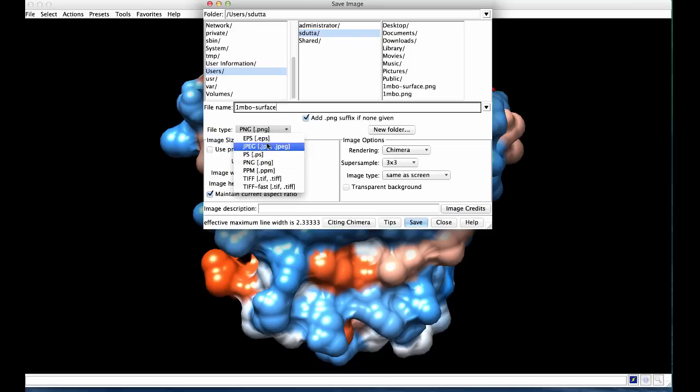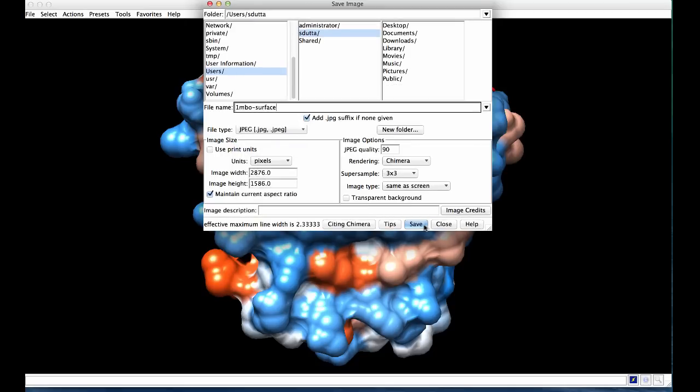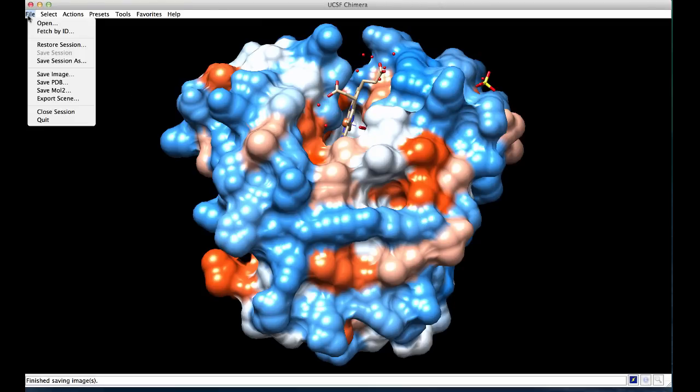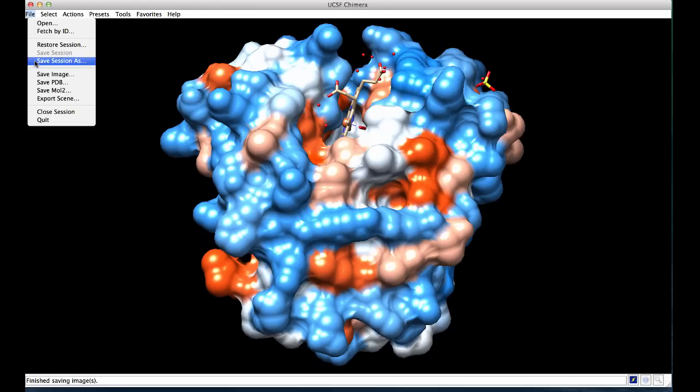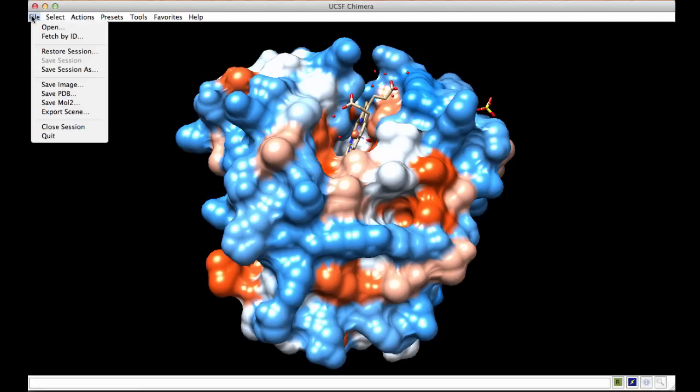You can also save a session which retains all the selections and molecules that are currently uploaded in this session. A saved session can be restored or reopened using this option in the file menu. Once you have finished working with the file, you can close the session and start a new one or quit out of the program.